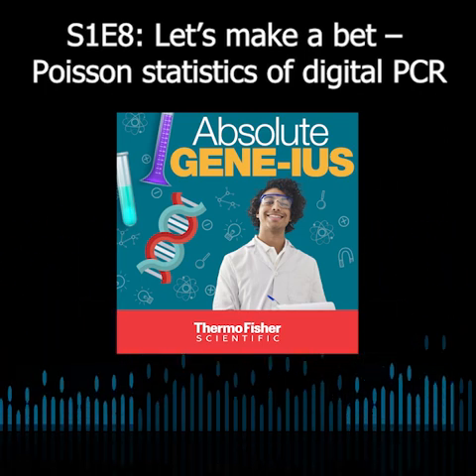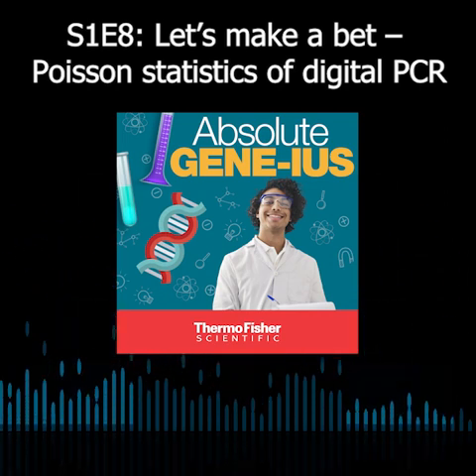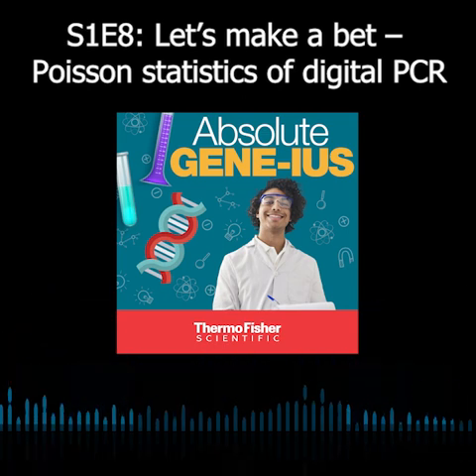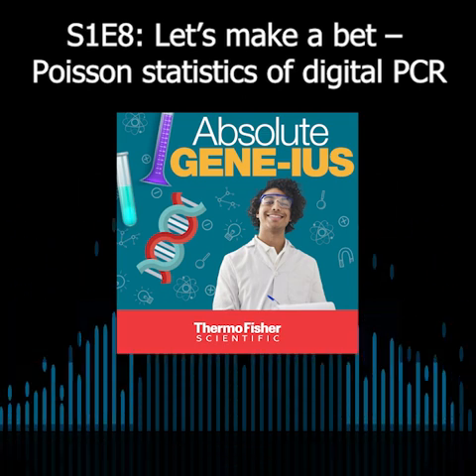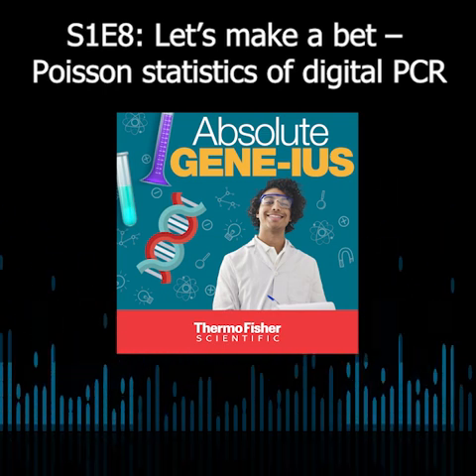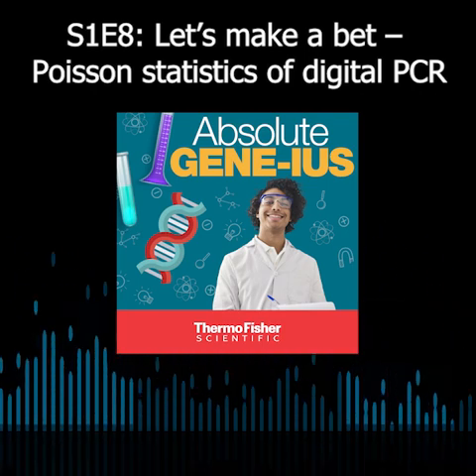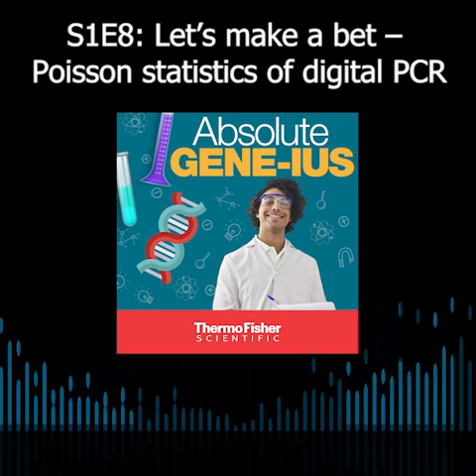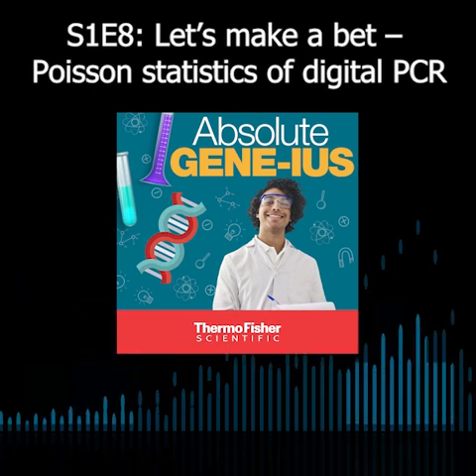And the reason I like to use that illustration is because it opens that door to your mind of, all right, I don't have a good intuitive grasp of this, and this is going to play into digital PCR shortly. So it doesn't take a lot, and the reason for it is because it doesn't matter that there's 23 out of 365. It's that with those 23, there's so many possible combinations amongst them. There's, I don't know, on the order of 180 or something combinations that you can make.